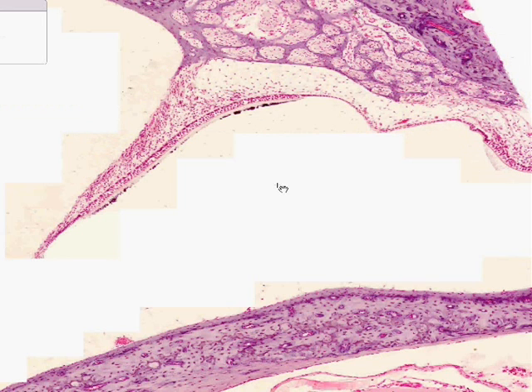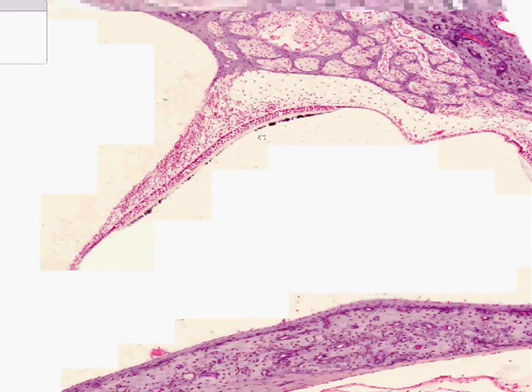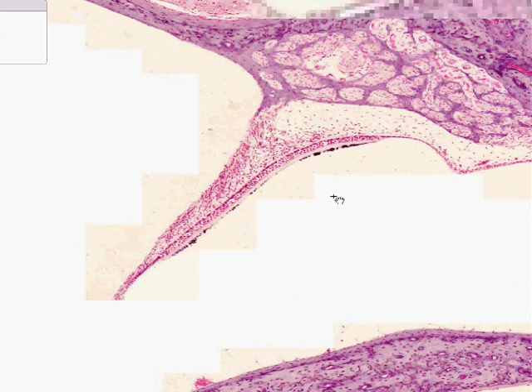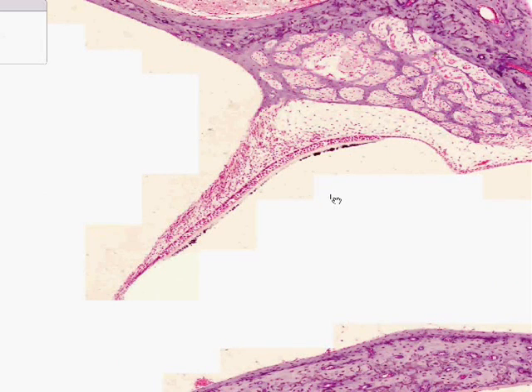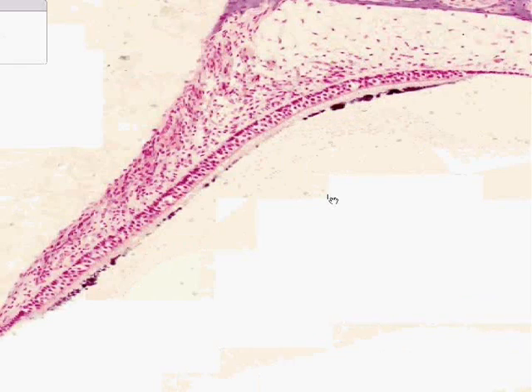It is easy to recognize either the saccule or utricle because you will see the macula here as this series of cells in which you have a gelatinous substance coating the surface, which is called the otolithic membrane. You can see these very small calcium particles in the otolithic membrane, which are the actual otoliths.